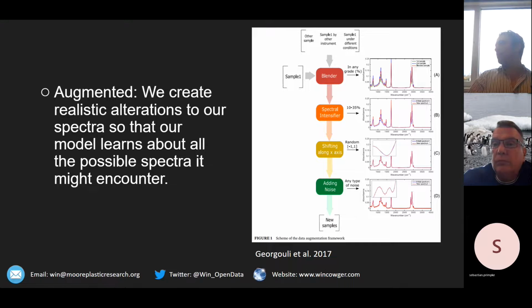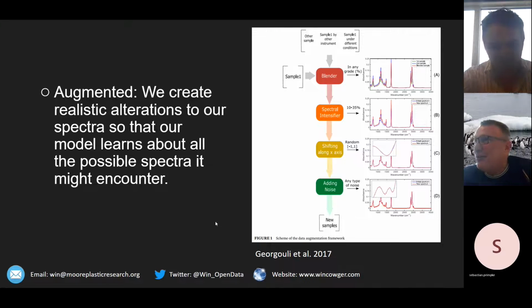And SiMPle has a tool to cut that off. But just getting back, we looked at our spectra from the silver filters. They were not as bad as we thought. It works relatively okay with the SiMPle software that you are going to explain now.